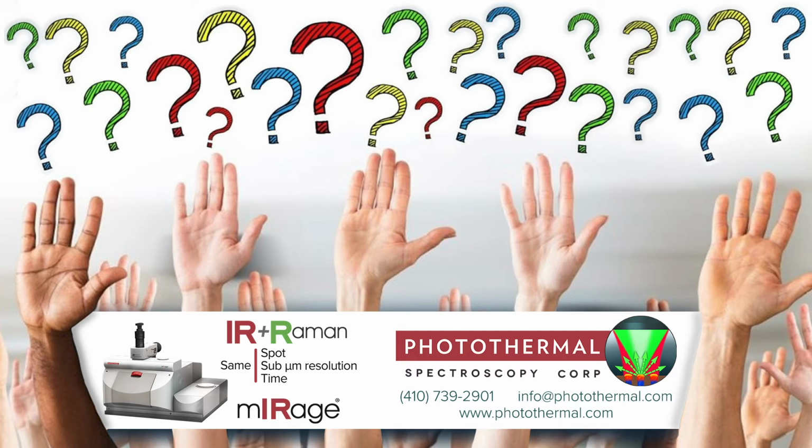The issue of stress is a good one. I know that Lisa Vicari has published a number of papers showing that if you squash the cells between two plates, there's some evidence that you are initiating some kind of stress response. We don't think our cells are particularly squashed, because we know there is a water gap.